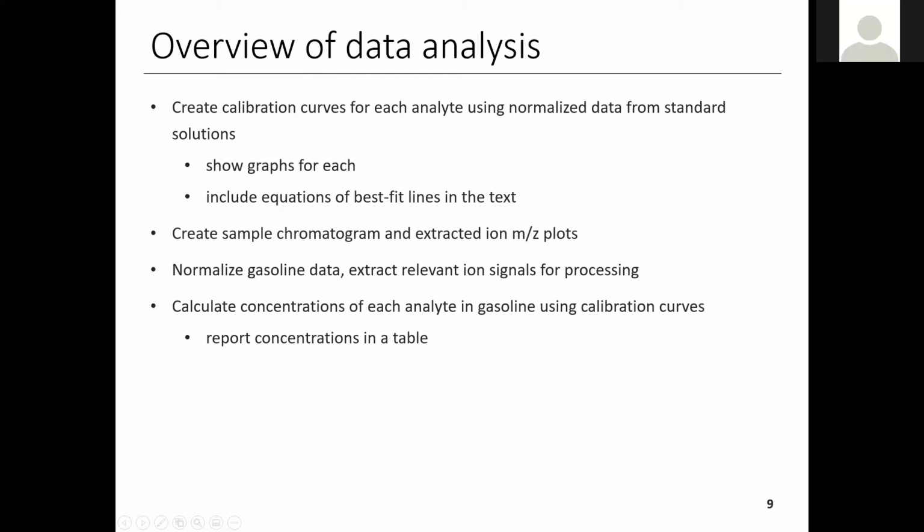This is a real overview. The only thing we use OpenChrom for is to visualize the graphs before we get in and start graphing them ourselves in Excel. We're not exporting the data because you already did that for us in the integrated solutions. All right, perfect. I just wanted to make sure I wasn't missing something from OpenChrom carryover.